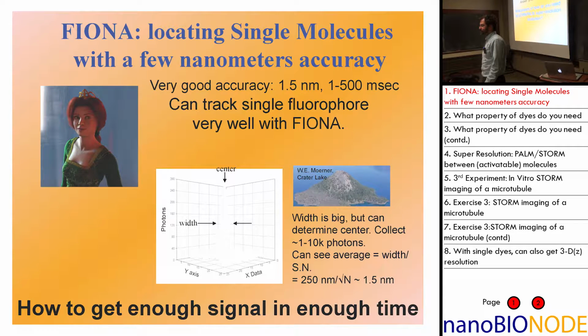Turning on the dyes, so we would like to control how many dyes per intensity pulse. Right. And also because we want to look at single dyes, that's why I thought they should have high intensity, enough intensity that we can distinguish them from the background. Right, okay, that's good.